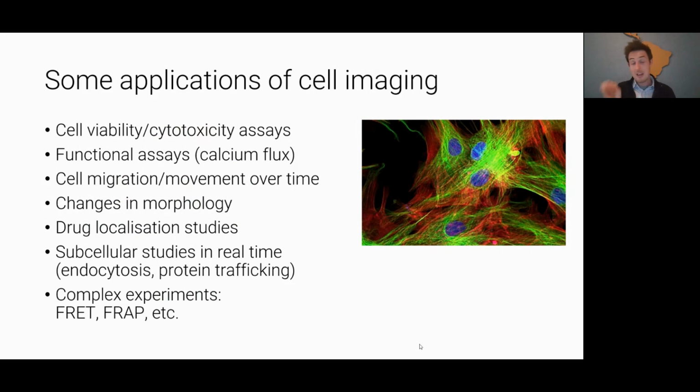So what you do there is, in your cellular environment, you actually deliberately and intentionally photobleach, very strongly irradiate a portion of the cell, and then you wait and you see what fluorescent molecules diffuse back into that cellular compartment or whatever it is that you're looking at. And so that fluorescence recovery after photobleaching, FRAP, can also be very valuable at looking at those kinds of dynamic events within a cell.